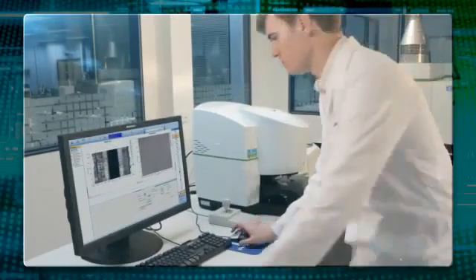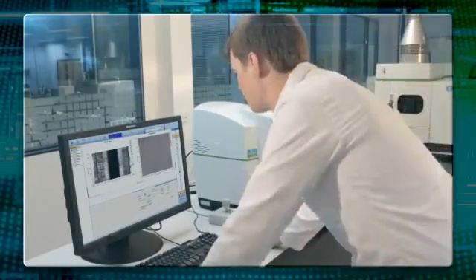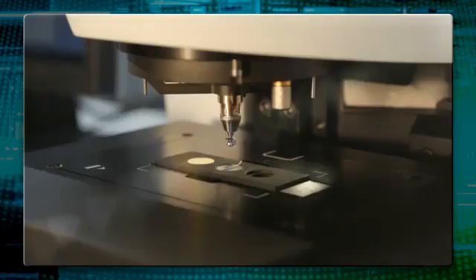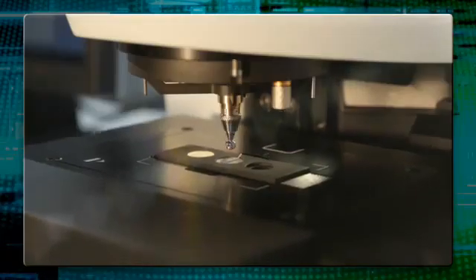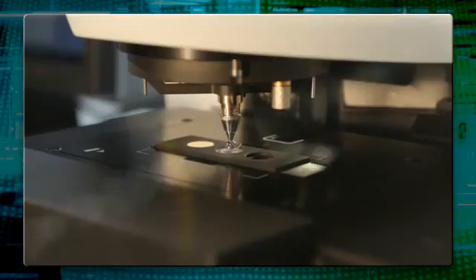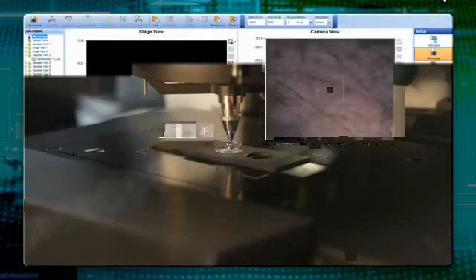Spotlight's advanced technology offers improved sampling with automated setup and operation. Now you can complete setup and characterization faster than ever before.